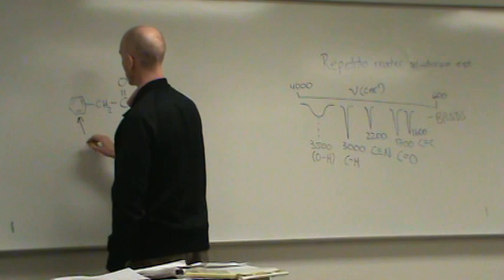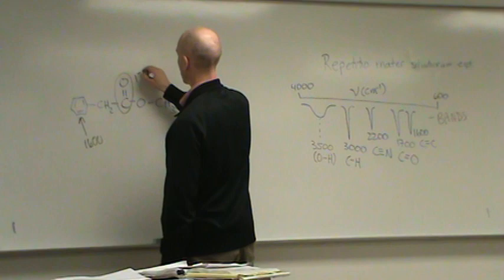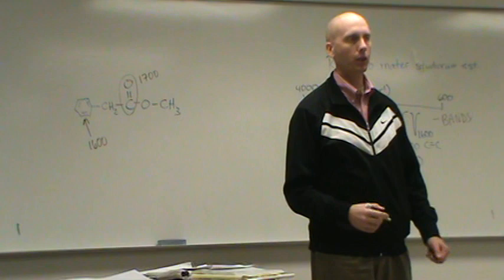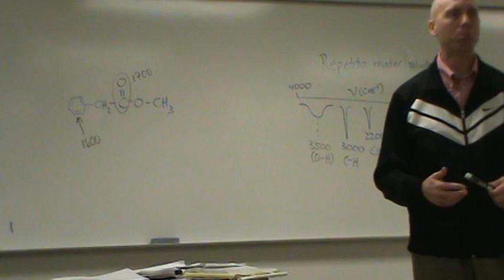Okay, around 1,600. Okay, found in the benzene. You knew you had a carbonyl at 1,700. And you also knew you had carbon-hydrogen bonds, which, guess what? They'll be in all the molecules, mostly. So that's not going to be a huge help. Okay?